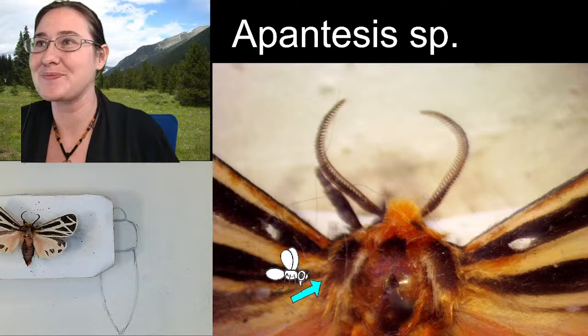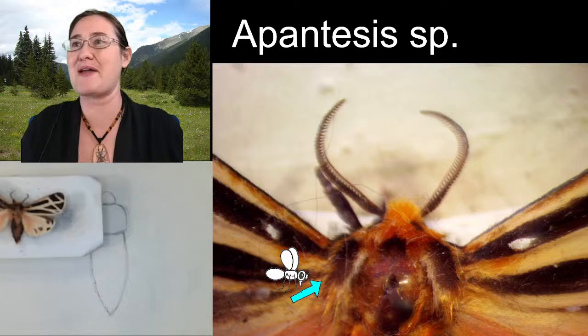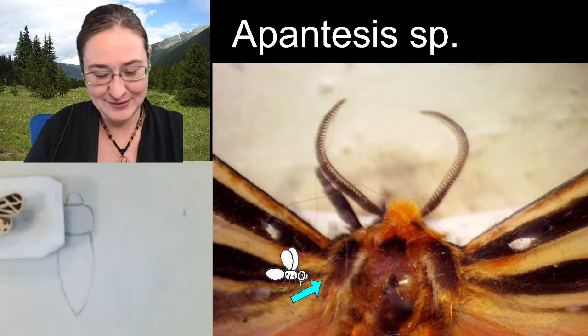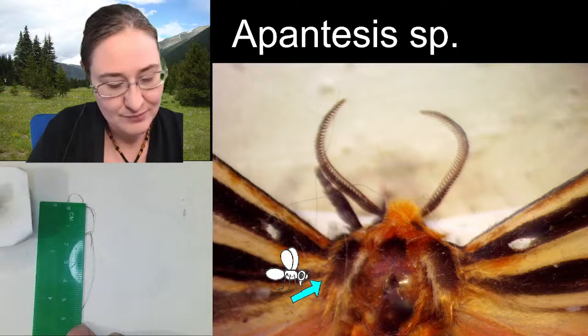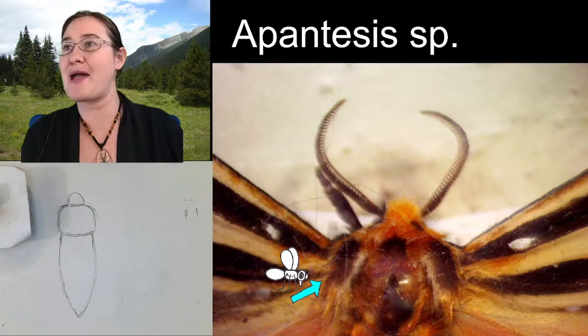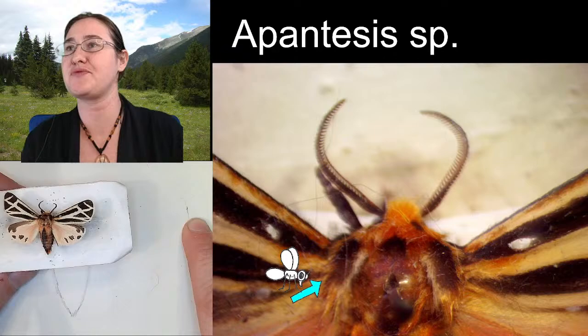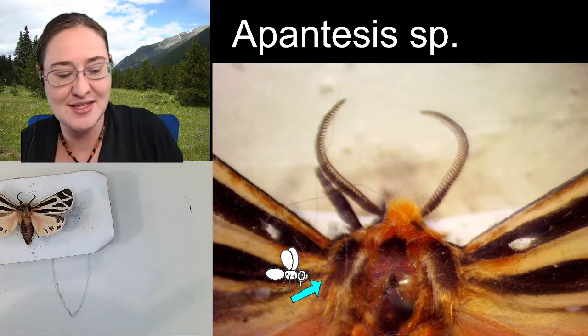All right. So what I'm going to do is take maybe a little bit longer than the abdomen and slide it out. And that's going to be my wingspan. Let's see. I was off by about half a centimeter. Yeah. There we go. All right, so that's going to give me my wingspan here, at least for the front wing. The hind wing is a lot shorter.